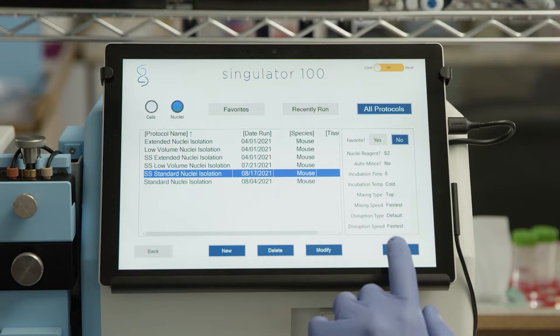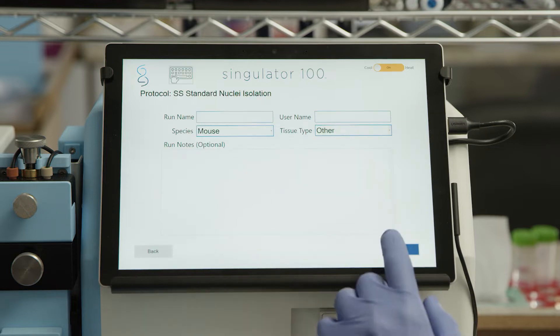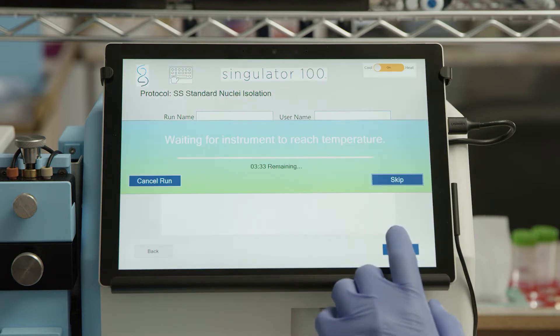Select the desired protocol and then select Next to proceed with a run or Modify to make changes to the default run parameters.